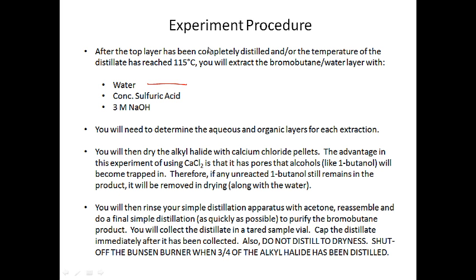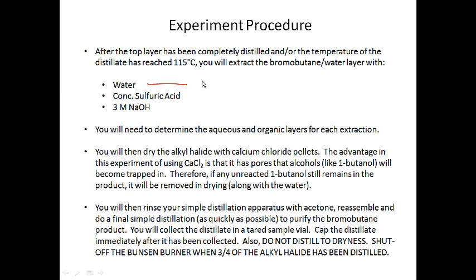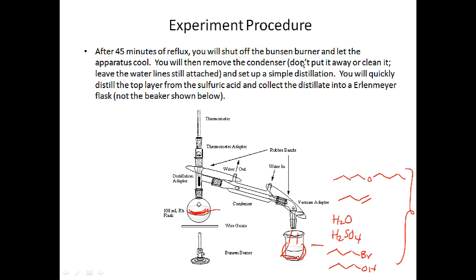What's the water going to do? Well, in terms of the extraction, we're going to get 2 layers here, an aqueous layer and an organic layer. I don't know which is which because it changes between students. What's going to be in our aqueous layer? Well, water, duh. Then what else? We're going to have sulfuric acid if we had a few traces of that left over. And of these products, that's about it.